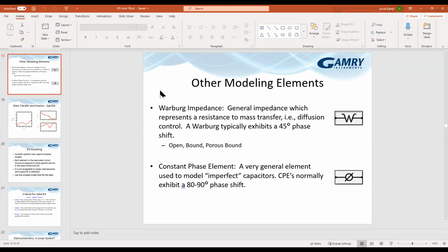If you're connecting to a very high impedance system and you're not careful about things like open circuit potential and whether or not you've got a reference in there or reference lead connected, you can cause damage to a cell. So our potentiostats are all 4 terminal devices. That is, there are 2 leads for voltage sensing and 2 leads for current carrying. And all 4 of those need to be connected.